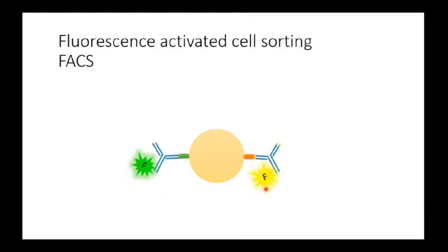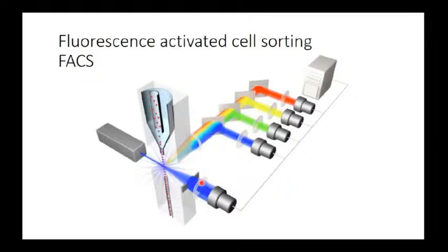How can we detect two different wavelengths? As I showed you before, the FACS machine contains different fluorescence detectors, and here we have the light filters, which deliver a particular wavelength to a particular detector. So every detector will detect a particular wavelength, and then we can use two different fluorophores if they emit light at different wavelengths. Okay.